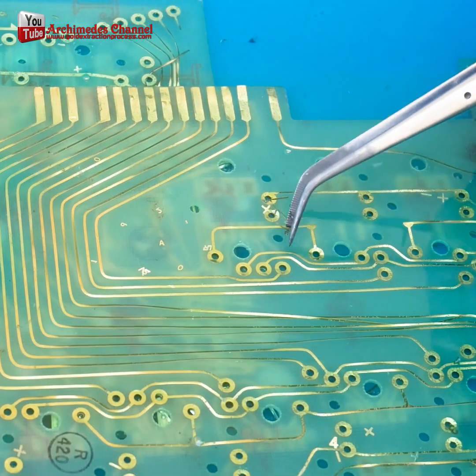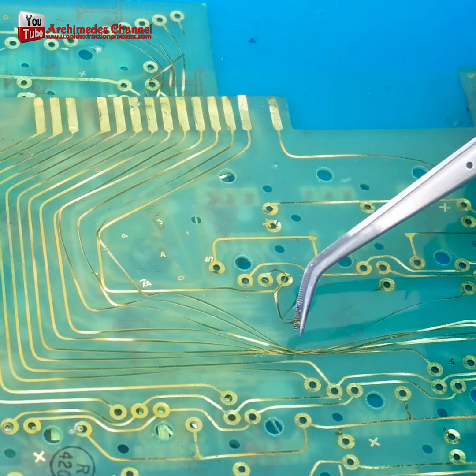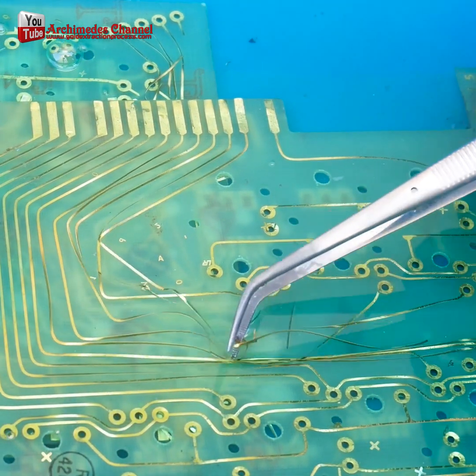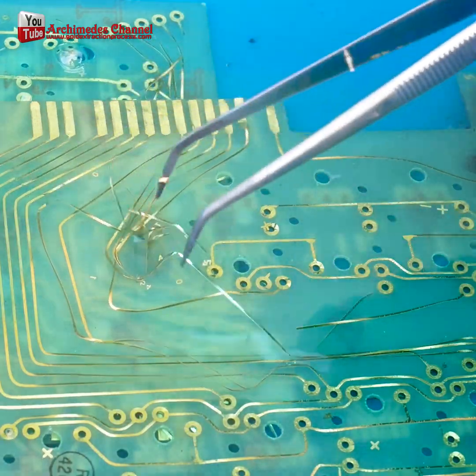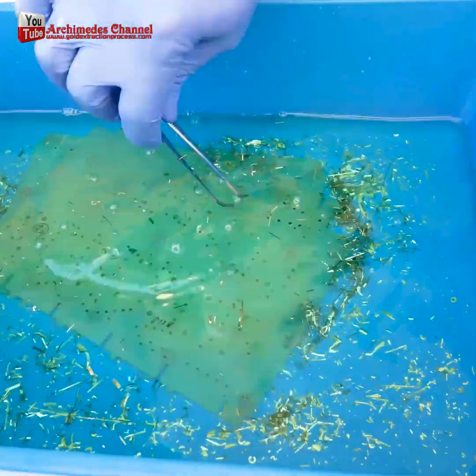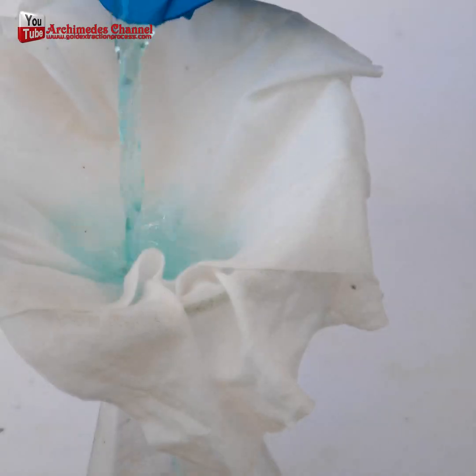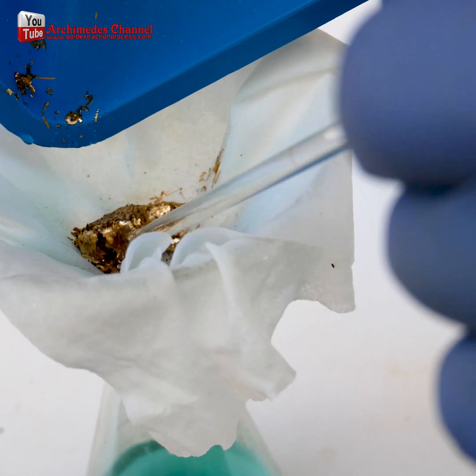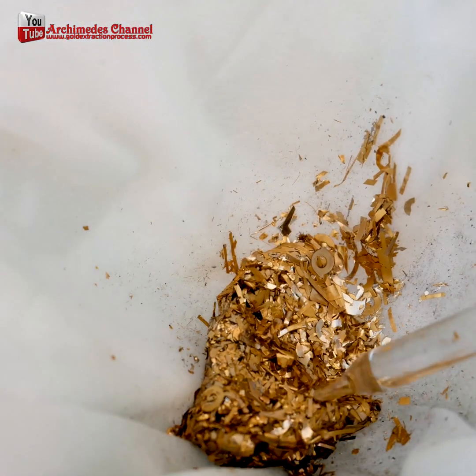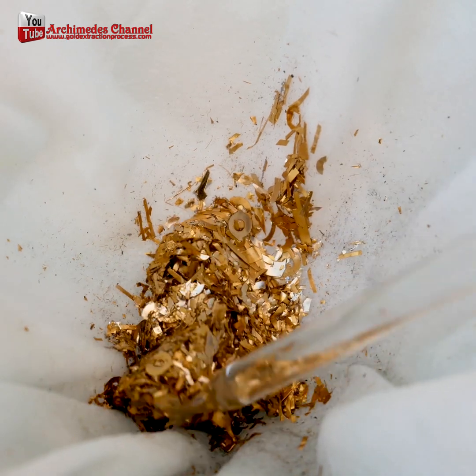You can see the gold stripes coming off the PCB, but this gold is not pure enough for the market. To solve this problem, use aqua regia acid. After the gold has been dissolved, use a filter paper or other filtering device to separate the gold from the acid solution. Aqua regia is just a mixture of two strong acids and doesn't have a chemical formula of its own.